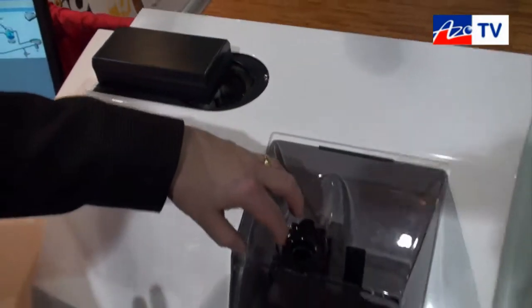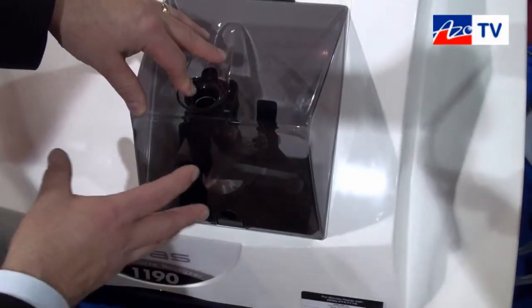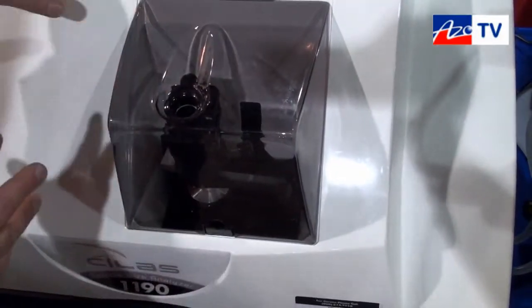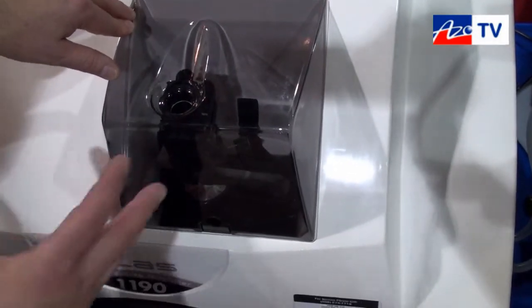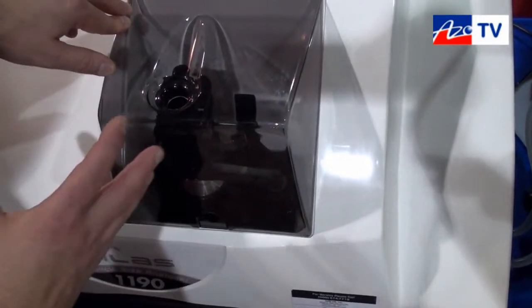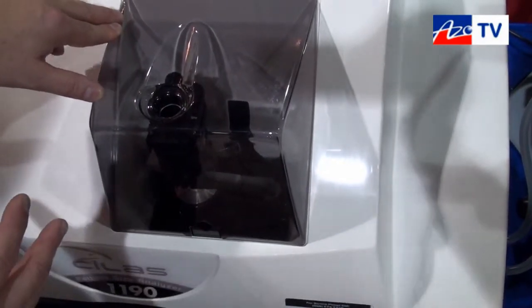For dry dispersion it's fully integrated so you would insert your dry sample in the vibratory feeder and you can switch back and forth with simple software without having to change physically any optical path or any lensing or any type of mechanical interface.